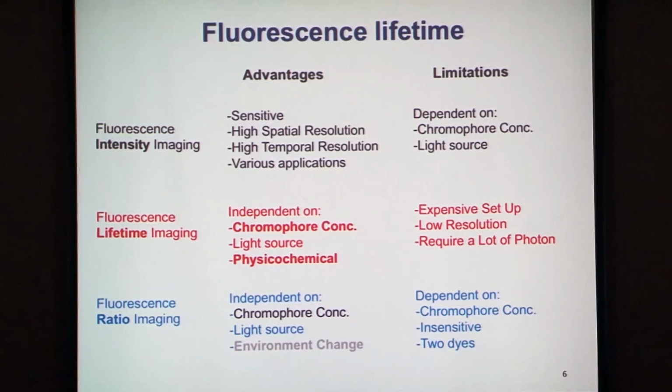On the other hand, fluorescence lifetime imaging does not depend on the chromophore concentration, so we don't have to bother with this artifact. The most important advantage of this methodology is chromophore-independent imaging. And furthermore, for me, what's more important is that fluorescence lifetime highly depends on physical chemical properties. The motivation of my work is to image temperature in cells, which is one of the most important environmental parameters. So I don't want data affected by other physical chemical properties. When we obtain the fluorescence lifetime, we also evaluate the contribution of other parameters.